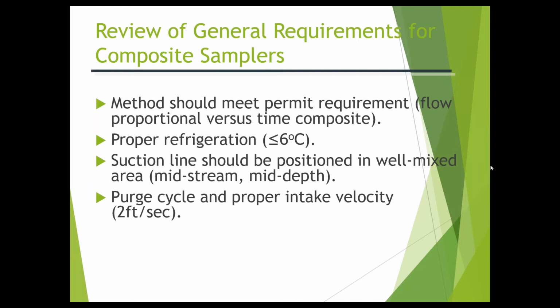Unless I'm looking at a homemade sampler where I have to go back and call the manufacturer, and I have done this and I continue to do this, I will call the manufacturer of the pump and make sure that the pump operates as it should. I normally listen to see if the pump is in good working order. Because if the pump is in good working order, Hawk, ISCO, Grayson, they all know that 2 feet per second is the gold standard, and they normally shoot higher than that.